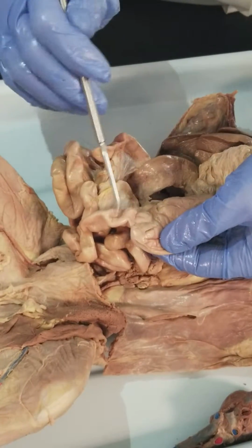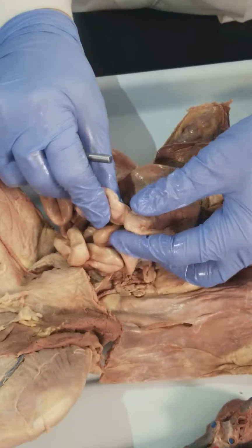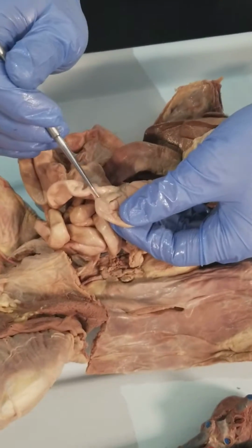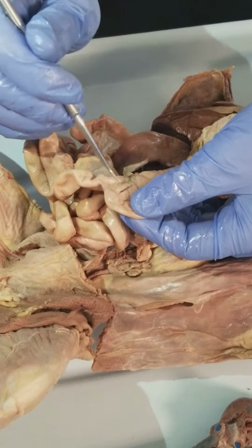So here's the ileum right here. This is going to be the ileocecal valve, and this is the cecum, where the large intestines begin. And so here you can kind of see a little hook or little horn on the end of the cecum. That's about where we would have our appendix in our bodies.